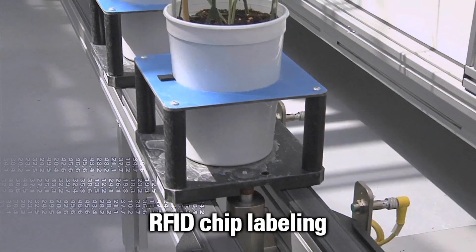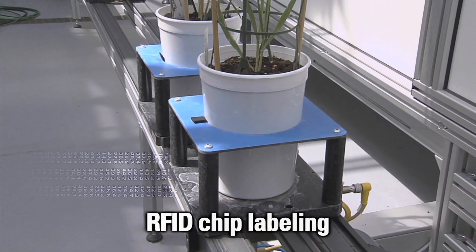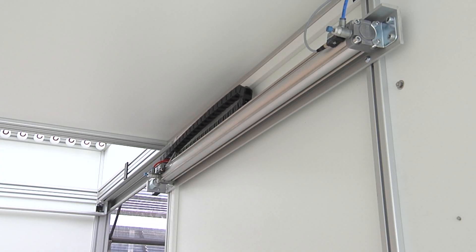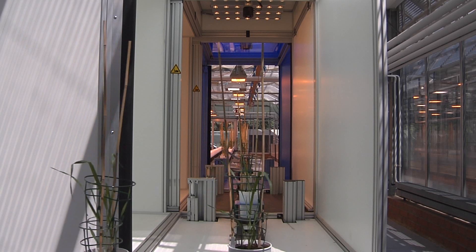By using latest RFID technology, each plant can be automatically identified and tracked throughout its whole life cycle in the greenhouse.